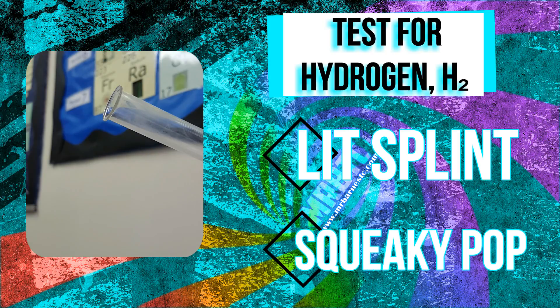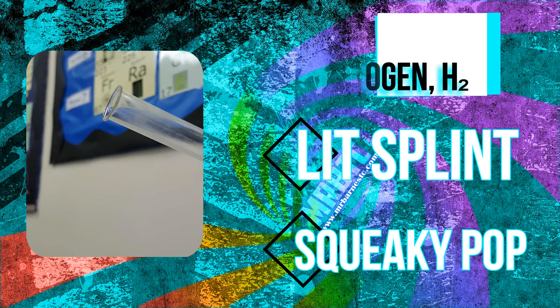As you can hear there, we have a squeaky pop sound, and that is your chemical test. So if you listen one more time — your chemical test is: add a lit splint, and you will get a squeaky pop sound if hydrogen is present.